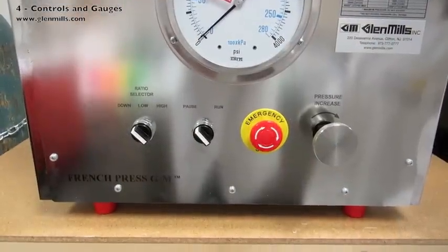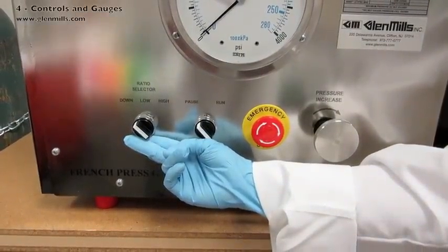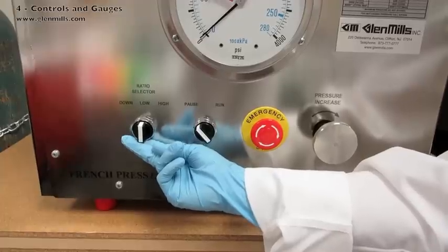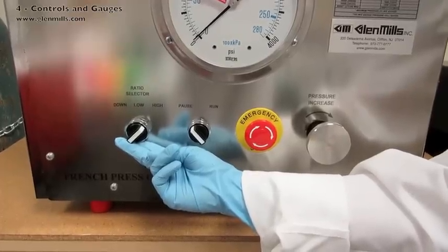The ratio selector sets the direction of the bottom platen. The choices are: down at the end of the run, low for when using the smaller mini cell, and high for today's run with this one-inch standard pressure cell.